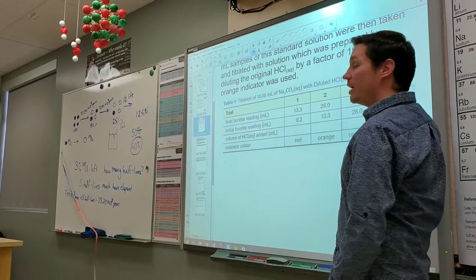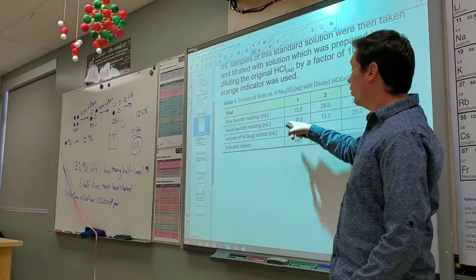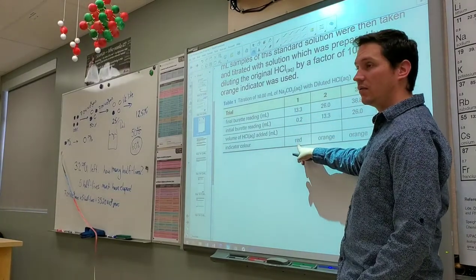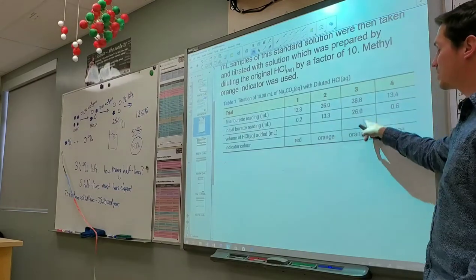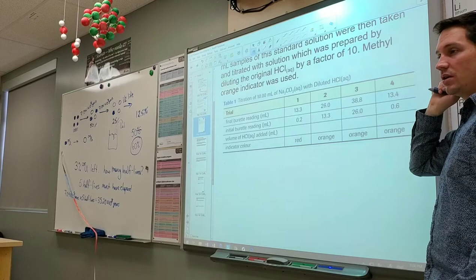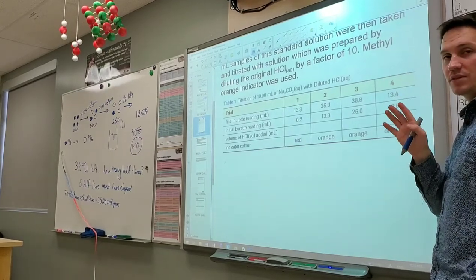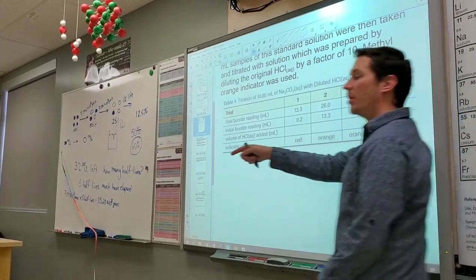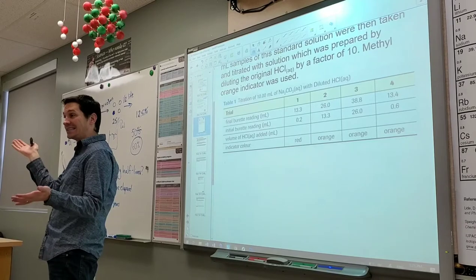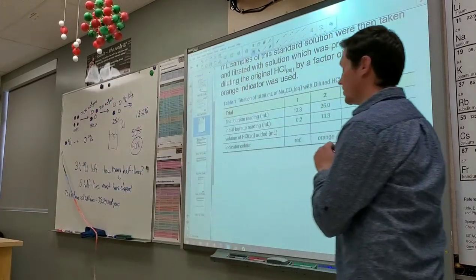Here's a very typical observation chart for a titration. When I titrated the first time, what color did I see? Red. When I titrated the next 3 times, what colors did I see? Orange. Immediately, you should be very suspicious of one of these, right? Do you remember how we went from blue all the way to yellow, but we were supposed to stop at green? So we overshot that first titration.